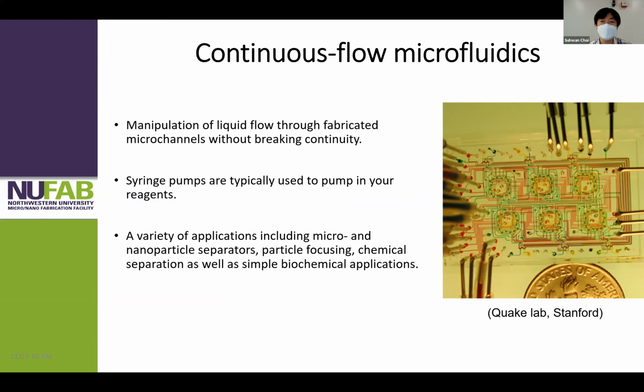Mostly people use a syringe pump or even a pressure-based pump to push the liquid through the microchannel. A variety of applications include micro and nano particle separation and focusing, chemical separations, and many other applications.